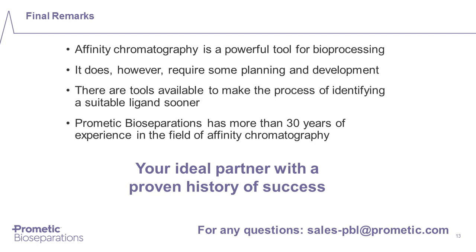Or if it's not, if you have a group of ligands that seem to be good, we can expand the library and concentrate in that chemical space. So produce a few more ligands that have similar characteristics to that one and test those. So it becomes an iterative process. And typically with 2 rounds of that, we get a ligand that works well enough for most cases.